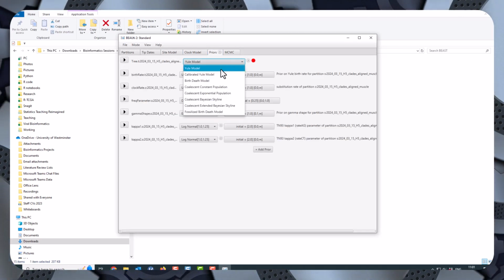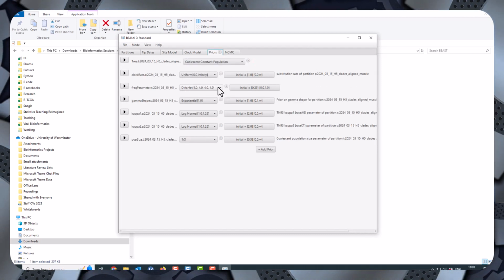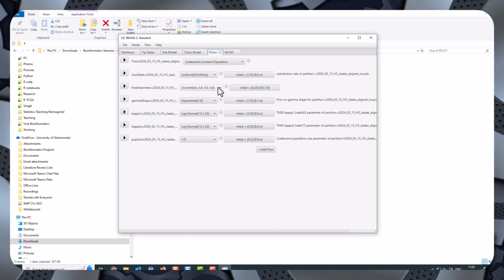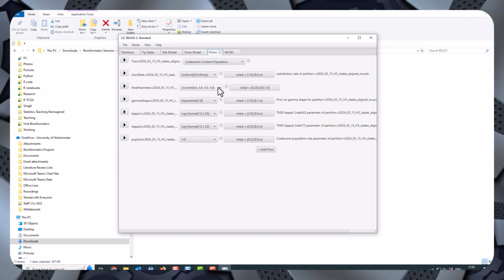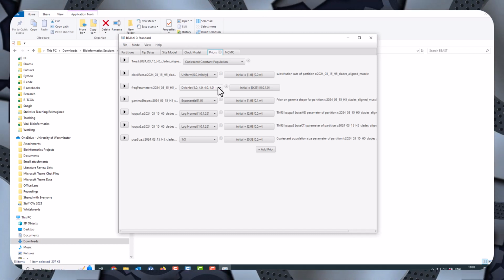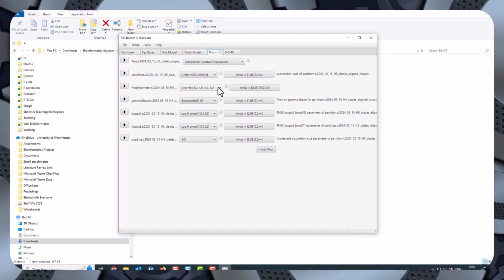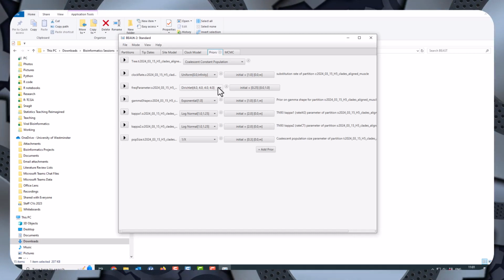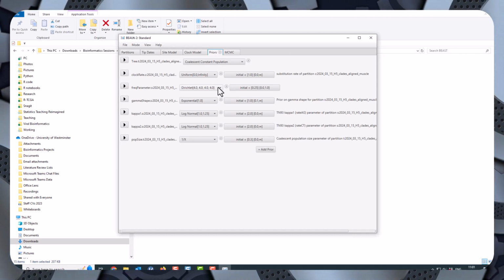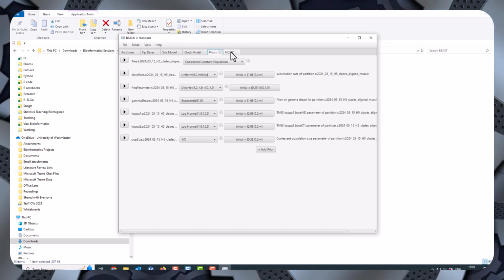With priors I can't use Yule, I have to use a coalescent model because otherwise the tips are ignored. Tip models require you to use a coalescent to do the modelling. Any other model is not compatible with that. Well, there are skyline plots, which also use the tip dates. So these are the two different ways of doing it. All the other parameters, I could make more sophisticated mathematical guesses, but I'm not going to.